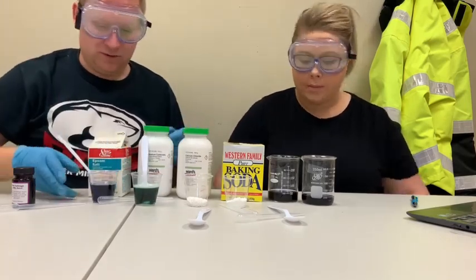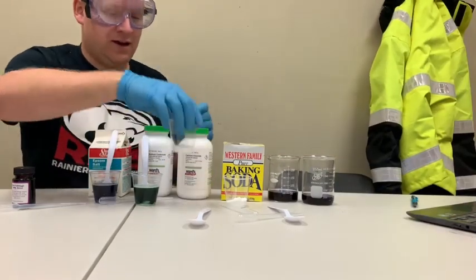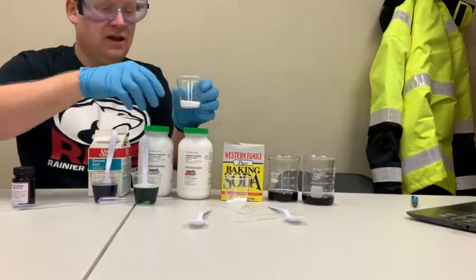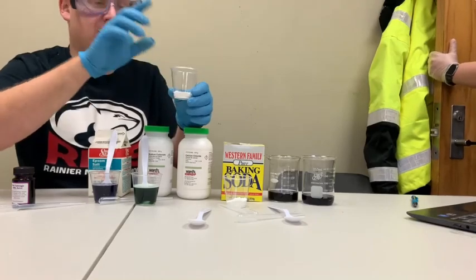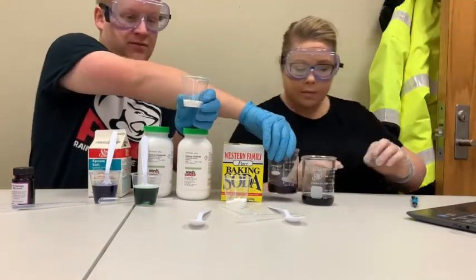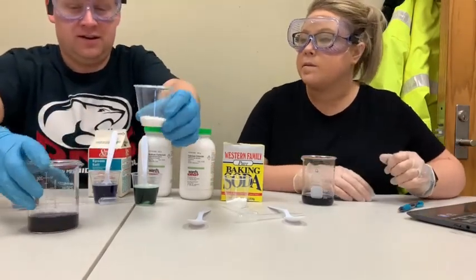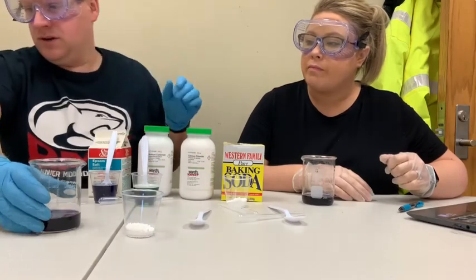Do you want to open the door so we're better ventilated for this one? So our next one is calcium chloride right here. This one will produce some fumes, so we have the windows open, the doors, we have some fans on to prevent us from the fumes. And so we'll take a look here, and we will observe.